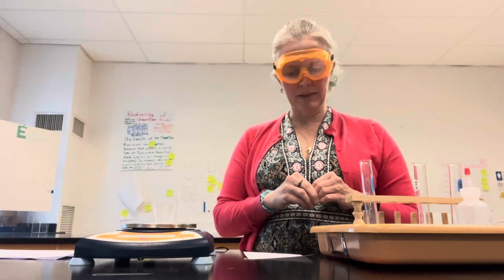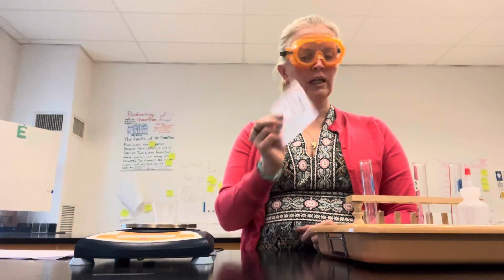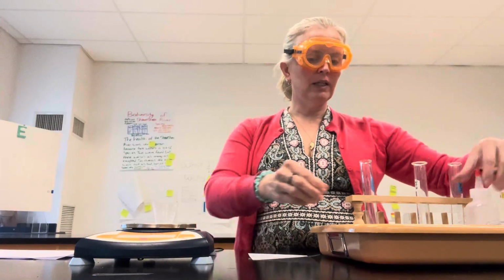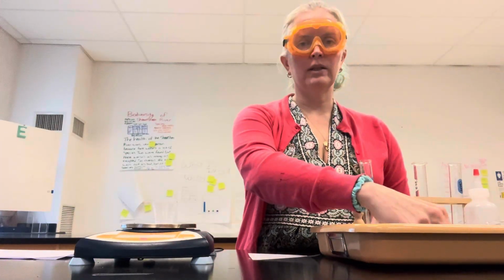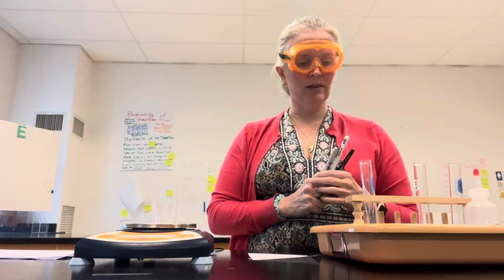So in this experiment, you're going to be trying to dissolve the ink, so we would call the ink the solute, using this solvent, which is alcohol. And each of the inks will look a little different when it's dissolved and separated using chromatography, and that will help us to identify which ink was used for the pass.